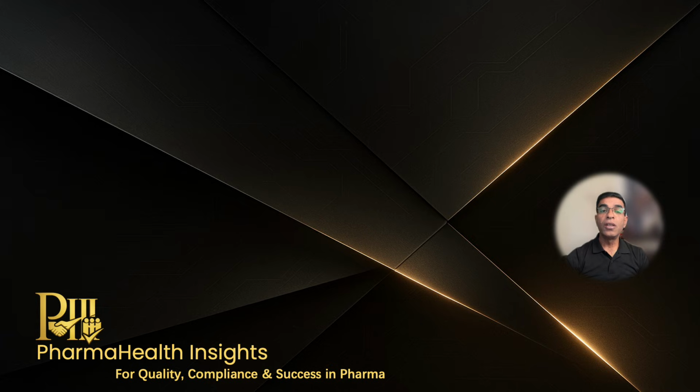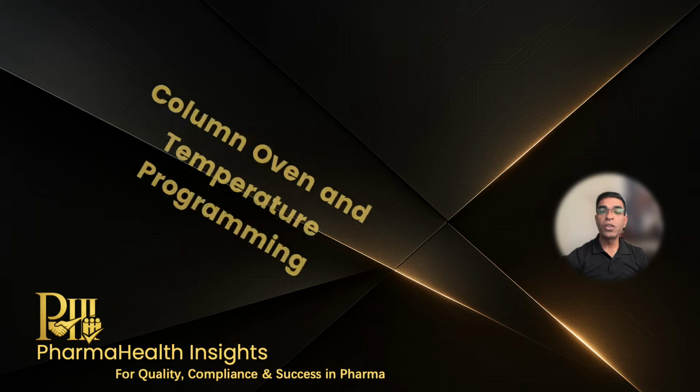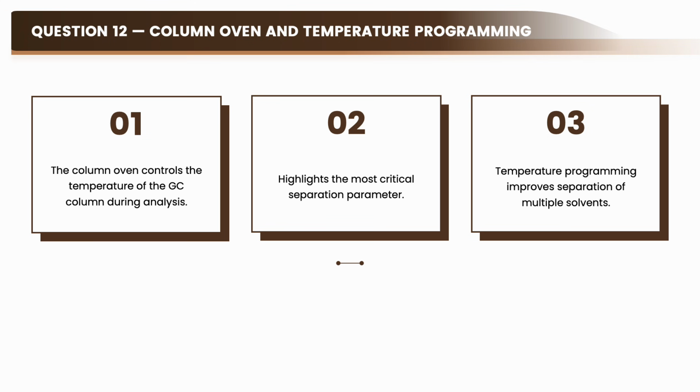After injections, now the interviewer will move to temperature control in GC. So the interviewer will definitely ask you, what is the role of column oven in GC? You should answer like this.